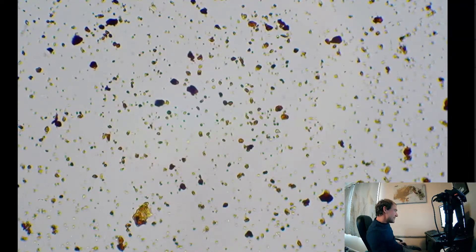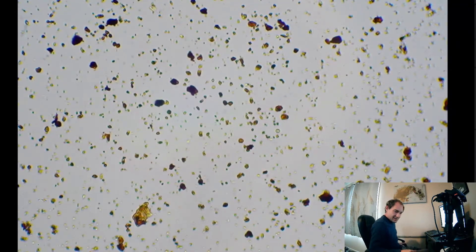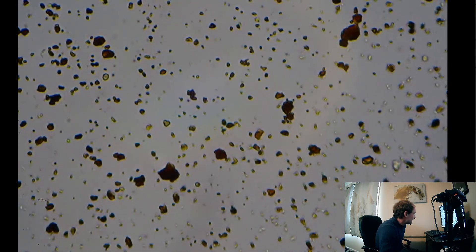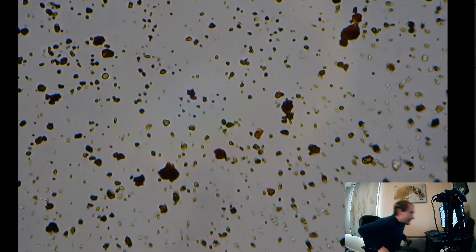Let's drop into 600x and take a little bit closer look at all these bacteria. All right, here's the hard part where I don't want to bump the 600x into the slide because that's very easy to do. Slowly trying to focus up, there we are. All right, and now we are in at 600x.